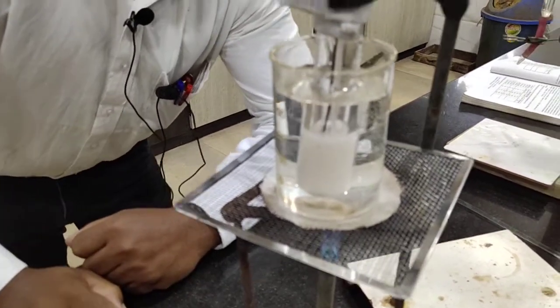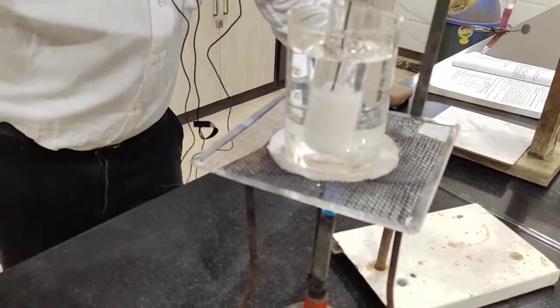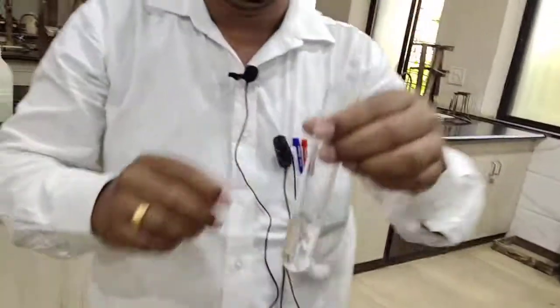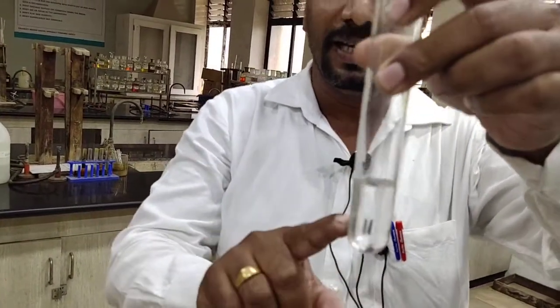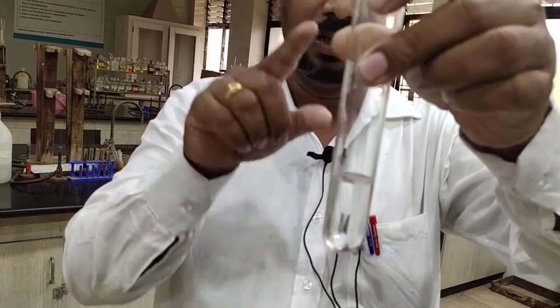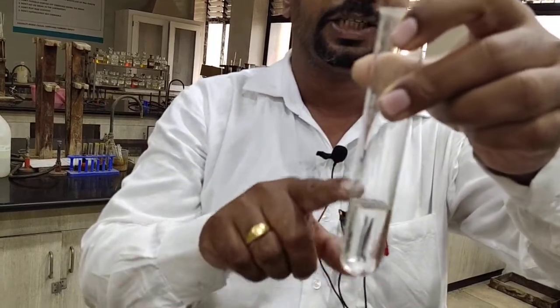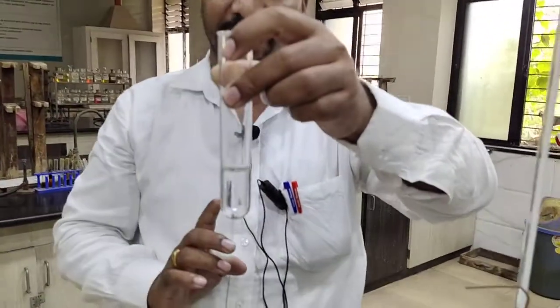Okay, when it reaches a particular temperature, the solution becomes clear and it will look like this. So this is the solution of water and phenol. When the solution becomes clear, that means the mixing temperature, we have to note this temperature as T1 and write it in the observation table.